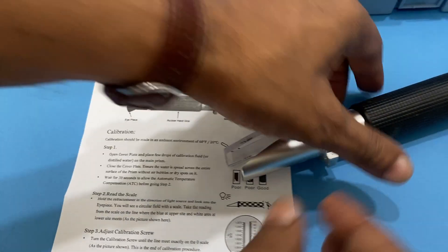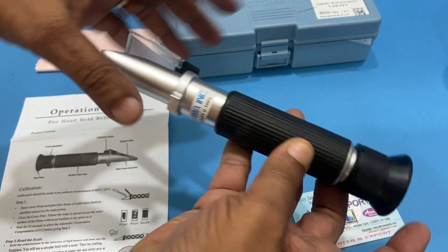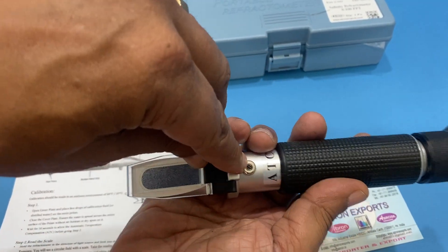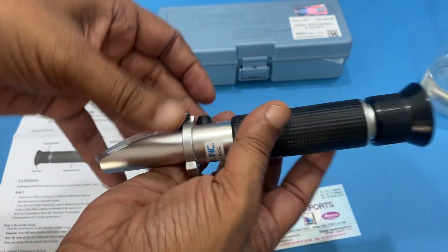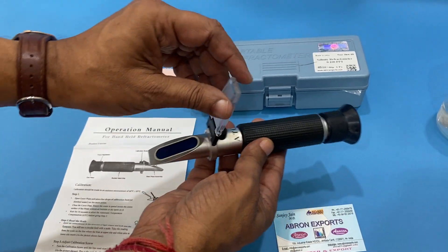This adjustment here is for focusing — you can focus from here using the eyepiece to view the plate. If you want to calibrate, there is a screw here for calibration. It also has ATC — automatic temperature compensation — and a zero to 100 percent salinity range for seawater.